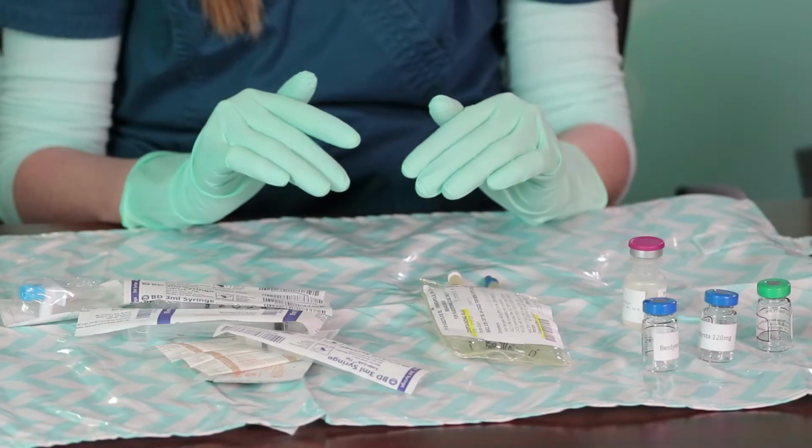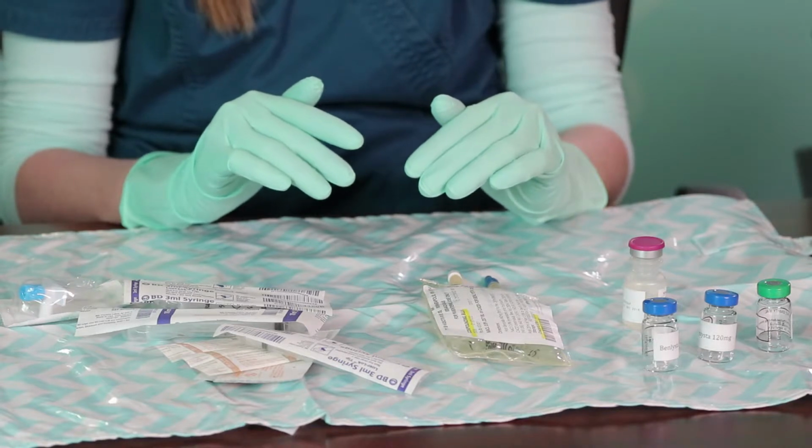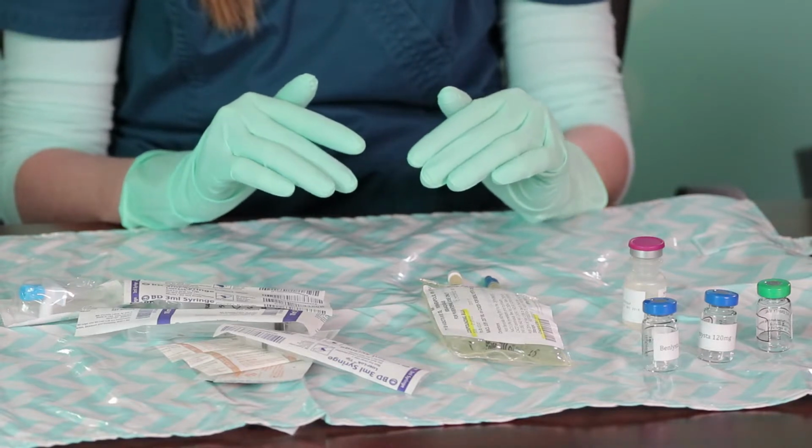Although this is not a sterile procedure, we still have taken the best practice from USP 797 of wearing sterile gloves when mixing medications in order to start with zero bioburden. This allows us to protect the patient. Mix drug using proper aseptic technique and compound medication per specific drug instructions.